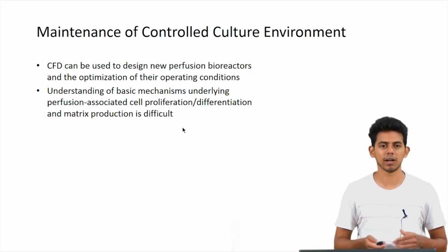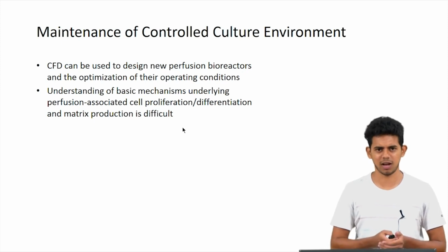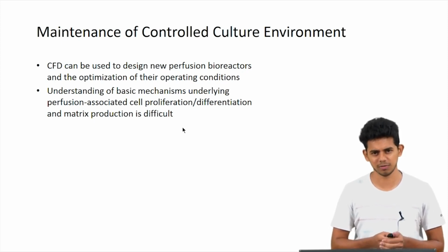But what is required for this mainly is to get to know the underlying mechanisms associated with perfusion, underlying perfusion associated cell proliferation.